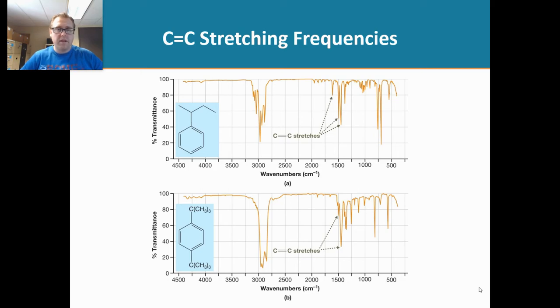Now let's focus our attention on alkenes. We're looking at the carbon-carbon double bond stretch, and that's going to show up in this region right here. When we look at our molecule, we have our carbon-carbon double bonds right there, and those signals, or those carbons that are circled, are right there.